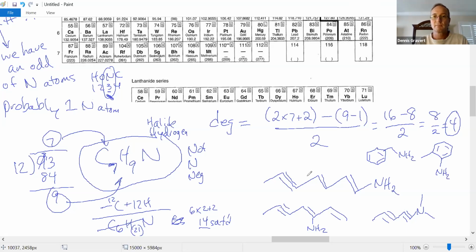Oh, you know what? Now think about functional groups. I got amines all over the place. What if there was a nitrile in the molecule, right? So you have a nitrogen carbon triple bond, that's a nitrile. And this is 1 out of 7 carbons, so I attach a second, third, fourth, fifth, sixth, seventh. So 1, 2, 3, 4, 5, 6, 7. Good, I got 2 degrees already, so put in 2 more, whatever I like. Okay, so there's some possible structures.